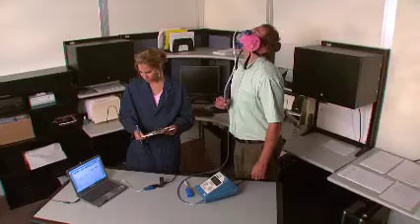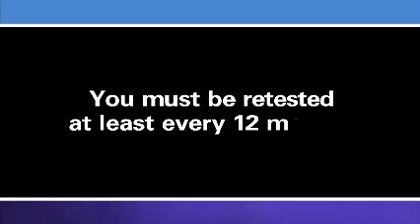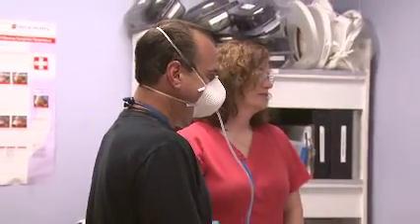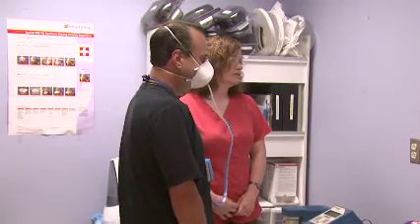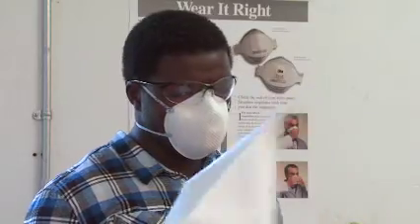You must be fit tested before you use a respirator in the workplace, and you must be retested at least every 12 months to make sure that the respirator you use still fits you. You must be fit tested with the specific make, model, style, and size of respirator that you will be using. Not everyone can get a good fit with one specific respirator.